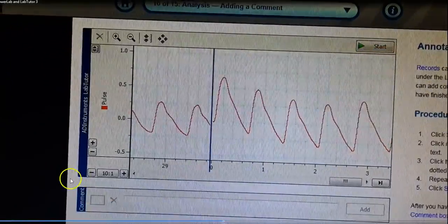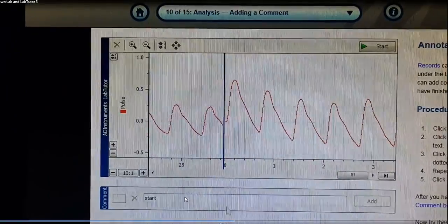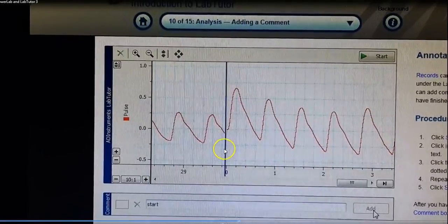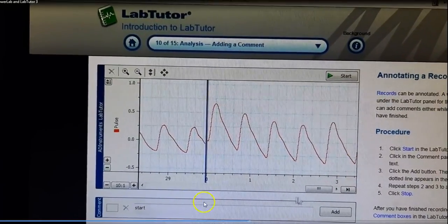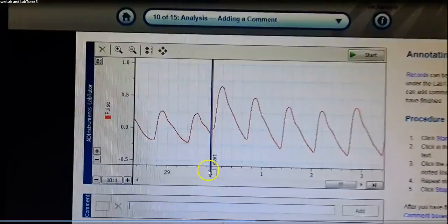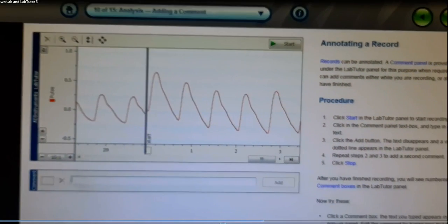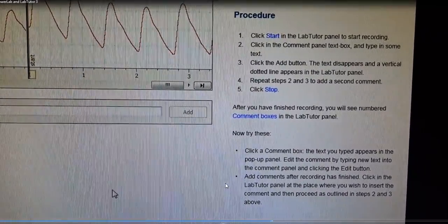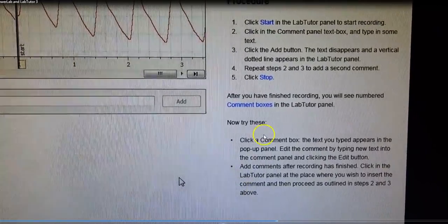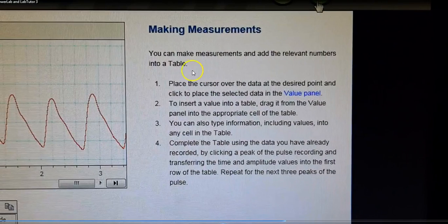So, we have here a new set of data. So you click on this line. Actually, before you start things, click on this side and then click on that. Once the add button is on it, at least you know that this is new data. Very important.